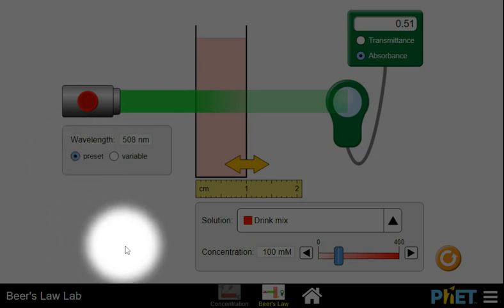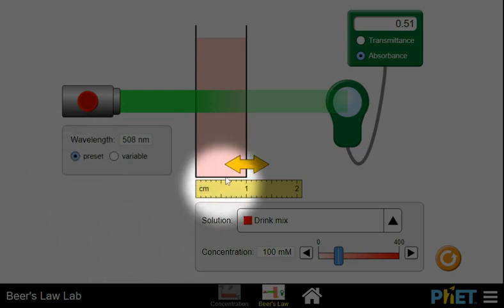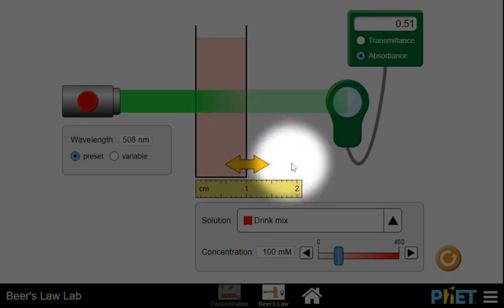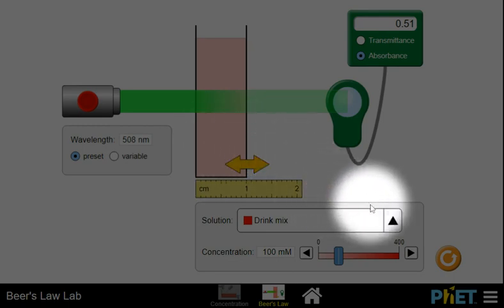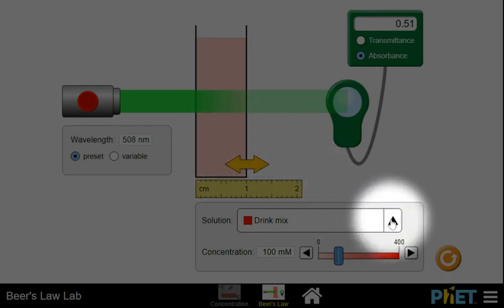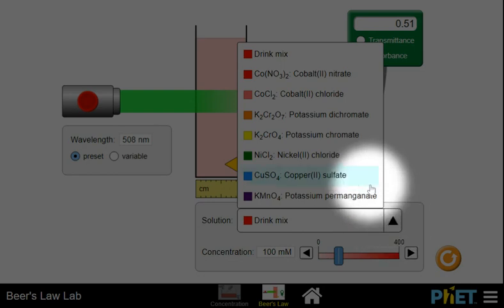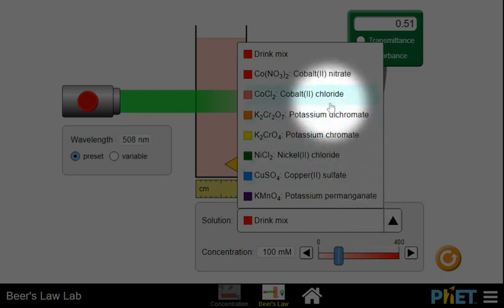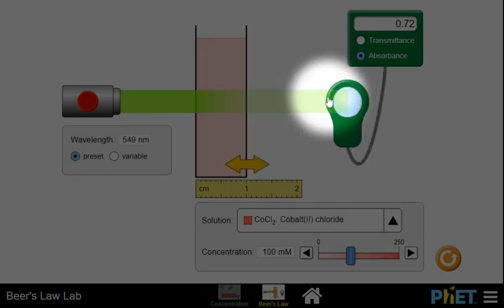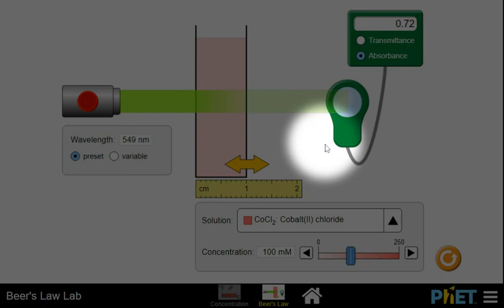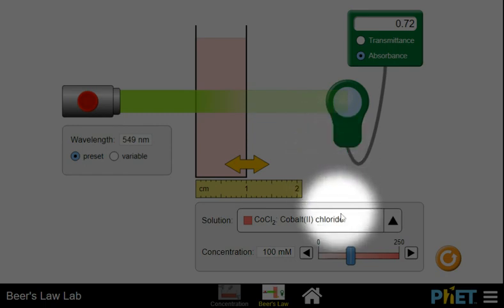We also can pick the solution that is inside the sample cell by clicking on the up arrow. We'll do some stuff with cobalt chloride and a few other things.